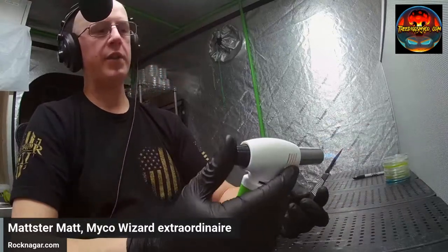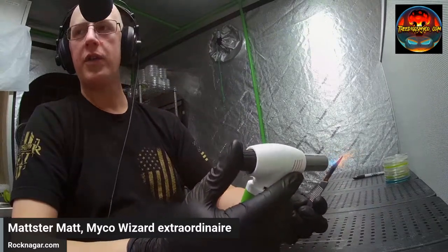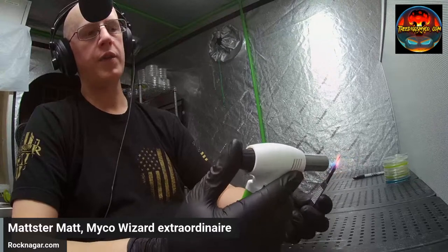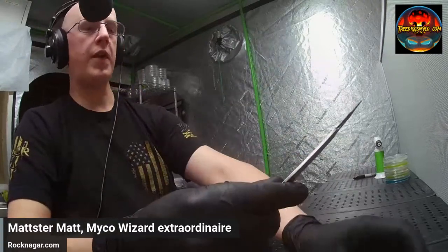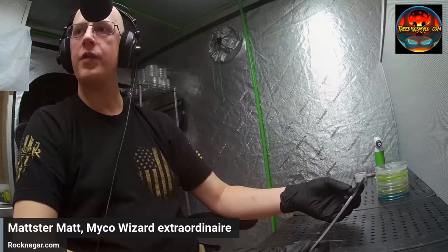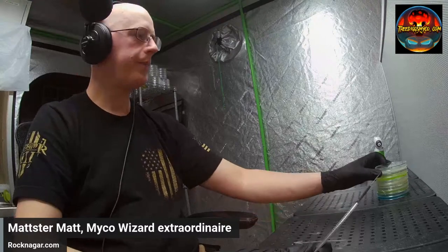Okay, so I will add that this is just one way to do these. Like, this is just for the mycelial growth pattern. I'm not really going for the super-duper artistic cavities right here. We will do that in the next little phase when the sterilizer cools off. I actually have a bunch of little cookie cutters, and we're going to pull some designs out with those random shaped cookie cutters and then fill those cavities with the fancy colored agar that I made up this morning.